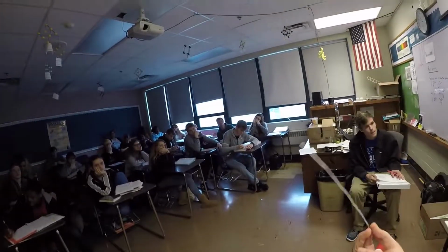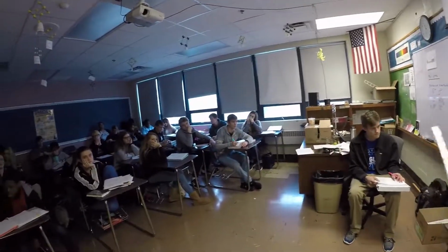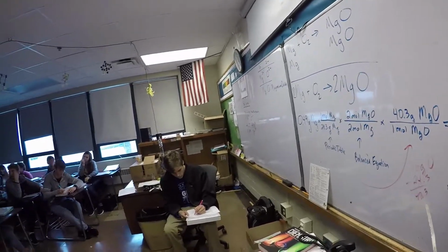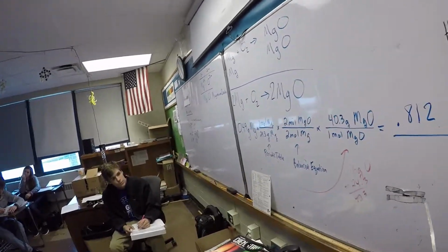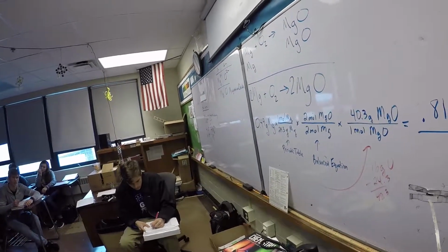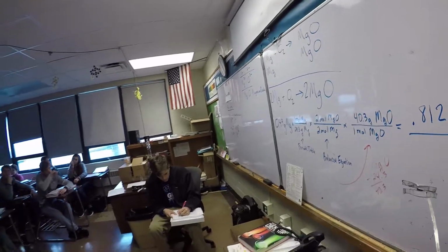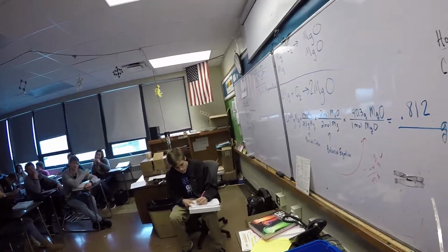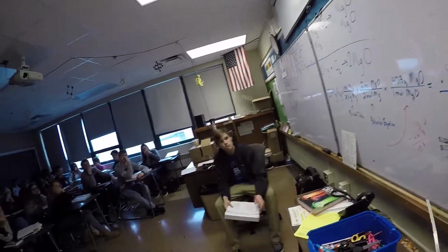Now, when you do this today, your error is going to be calculated by determining how close you are to this. So that goes in the denominator. It's in the handout that I gave you. And then you have 0.812. Let's say you got 0.75, which is what Kaya did, and she got around 6.2% error. This is how you calculate your error. You're trying to get this.